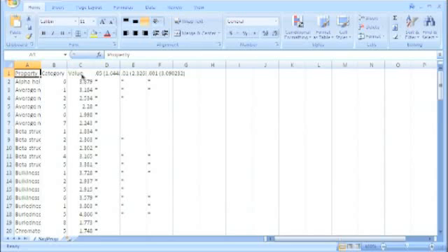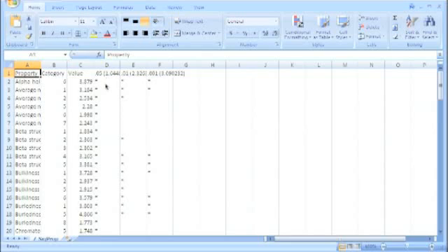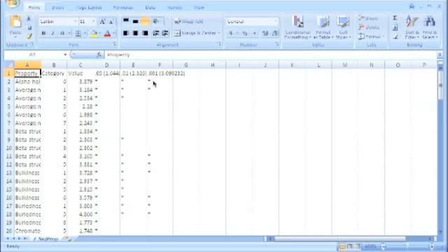The column value represents the p-value representing the statistical significance. And these last three columns are representing the degree of statistical significance. So if it is significant at the 0.05 level, that means there's only 5% chance of this happening due to just random chance. Again, at a 0.01 level, there's only 1 in 100 chance of this happening due to chance. The ones that we're going to be interested are these ones. There's only 1 in 1,000 chance that this change happened just randomly to chance.